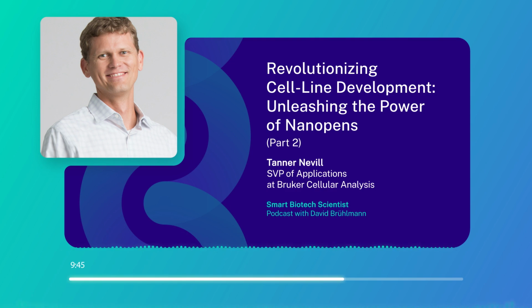I think that's what changes the game, right? Yep. And I think, to that point, understanding what's happening in the reactor, in your smaller scale reactors, during your scale up and your screening, that's the data you probably really care about. It's all about making sure you're screening for the right things at the very beginning so you don't have to scale up everything and test everything, because that adds a lot of cost to the process.